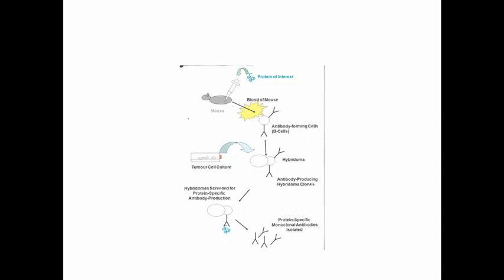So you're putting all of this together in your purification of aldolase, of being able to purify the protein. Explain to me how the specific activity and the Bradford assay allowed you to make judgments as to how efficient your purification was. Then you're going to be running it on the SDS gel and saying, here are all my proteins that are in S1, S2, S3, S4, and comparing that to the antibodies that are reacting specifically against aldolase.